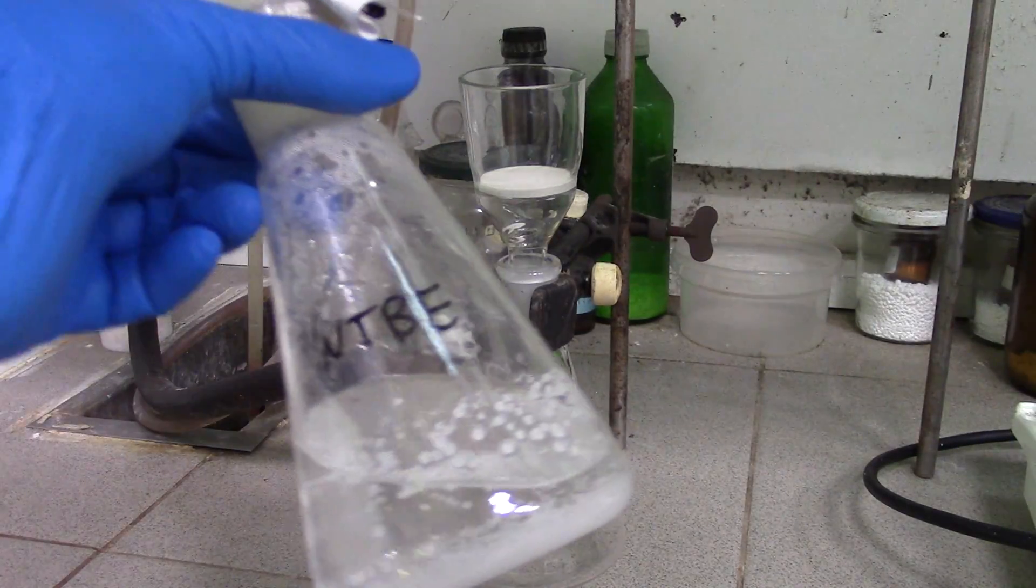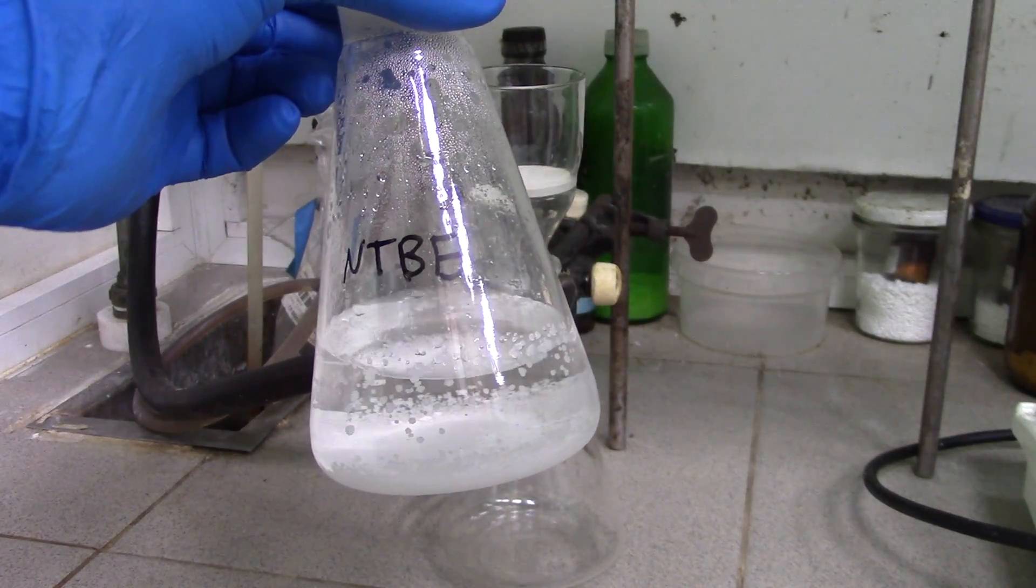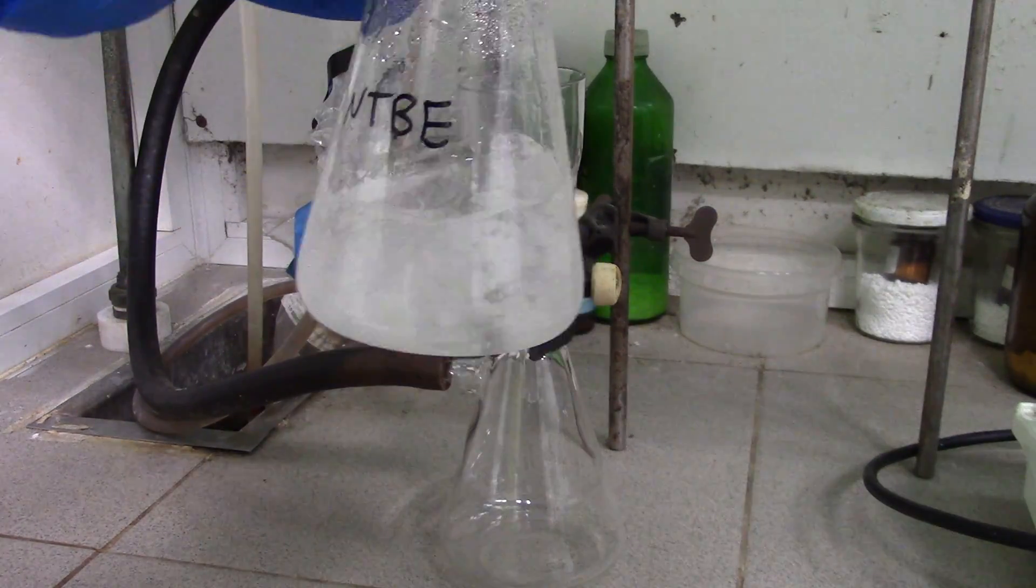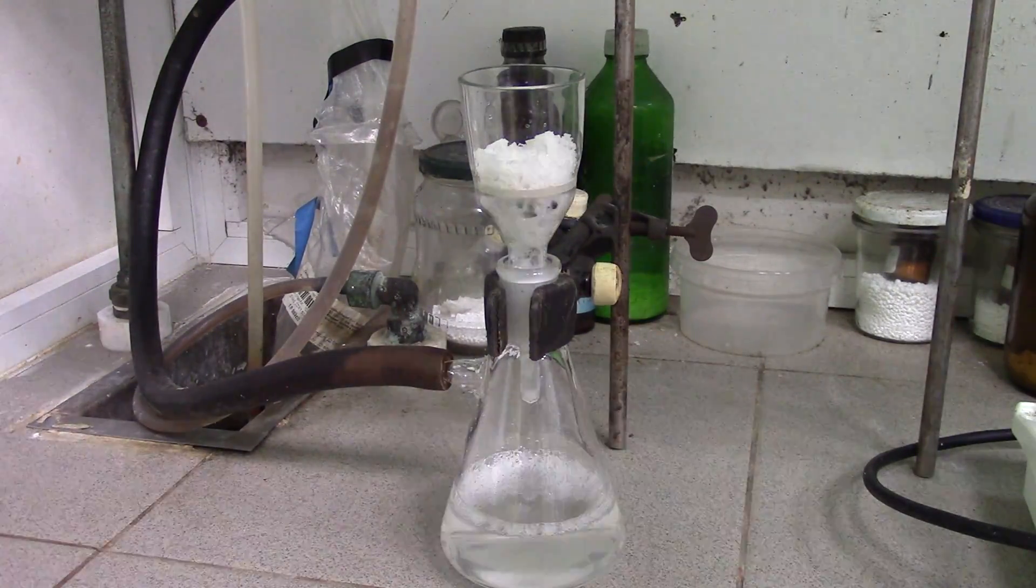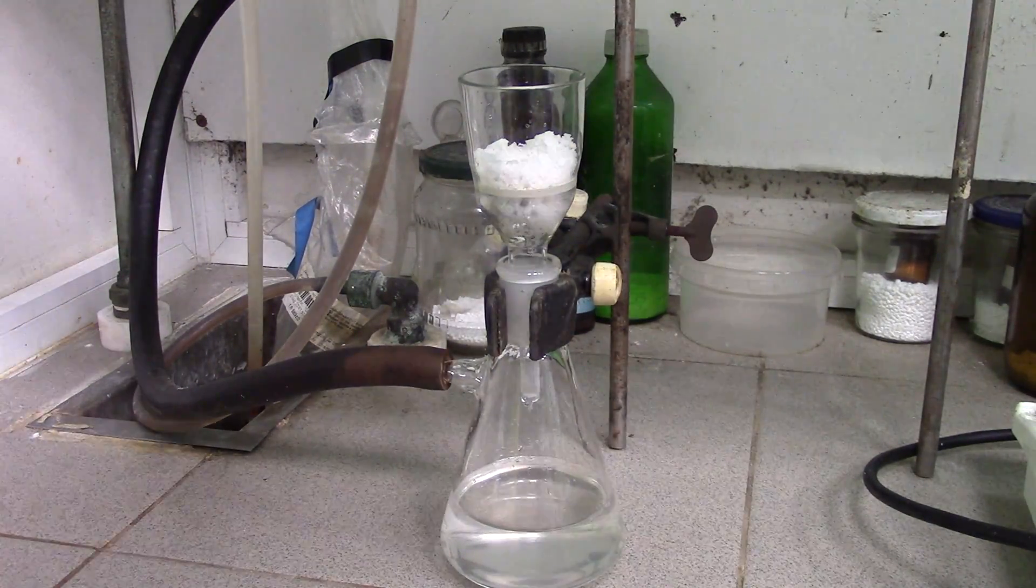On the next day, fine crystals of sodium tetraborate are crystallized out. Now just filter it off on a glass filter and wash a couple of times with isopropanol.